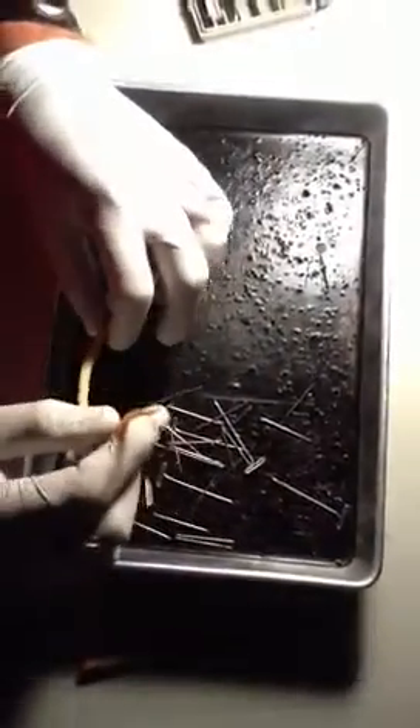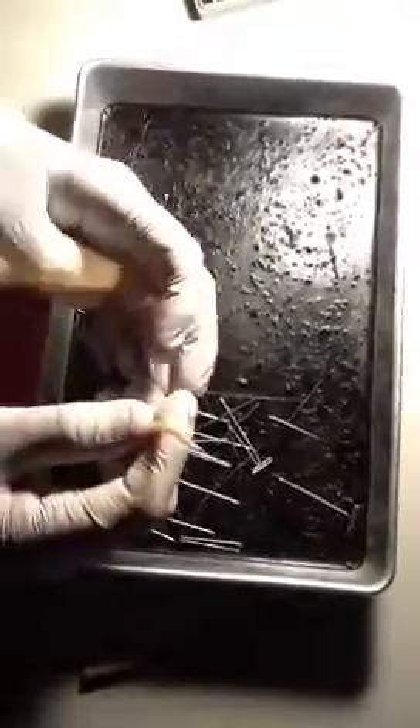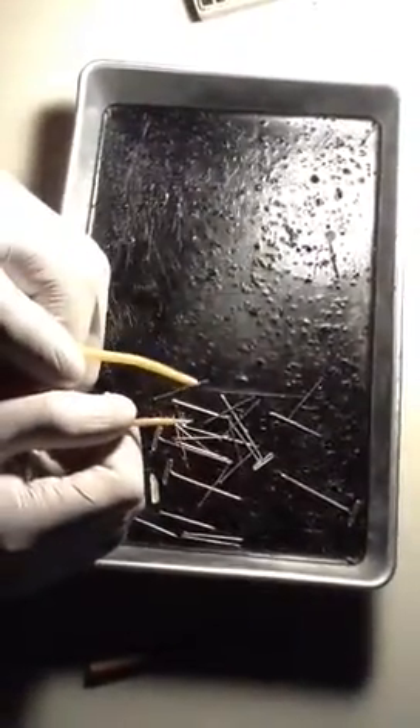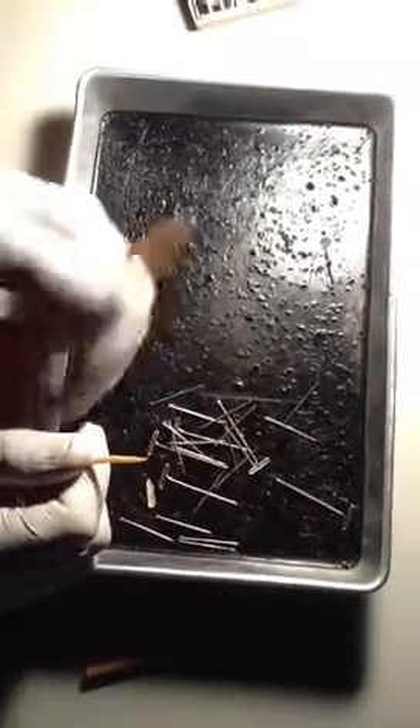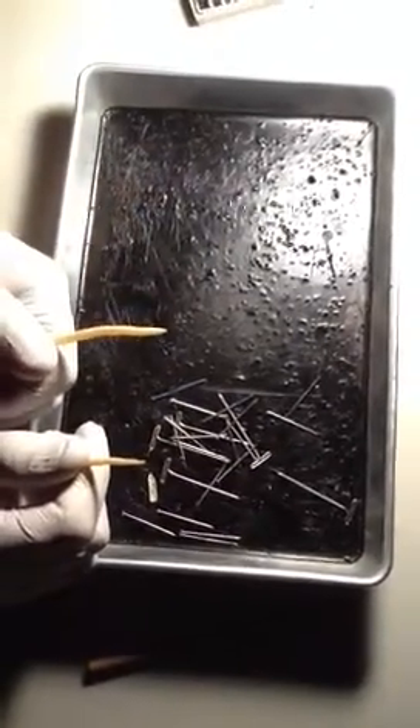I've got a sharp end, a little pointy end. See the difference in the pointy end and the round end? The pointy end is the head. The round end is the tail. You with me so far?